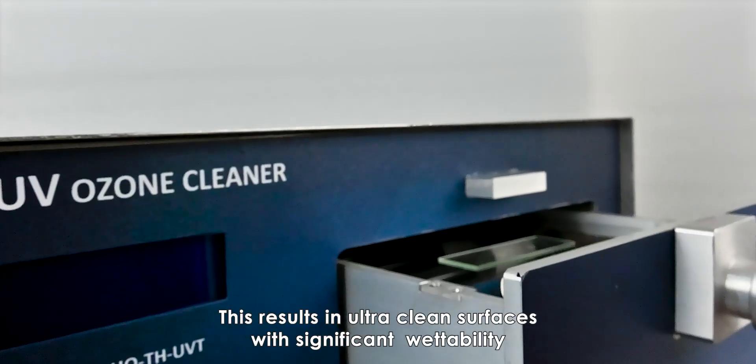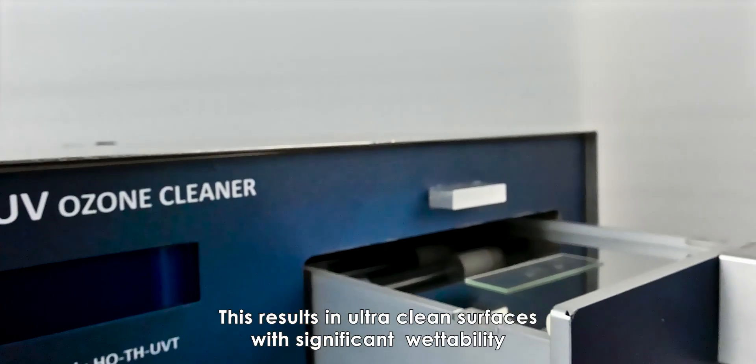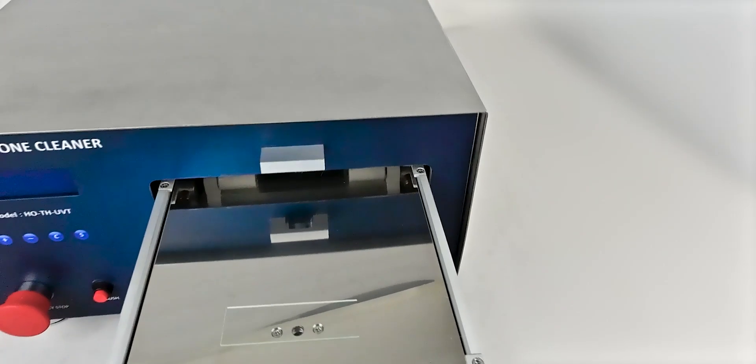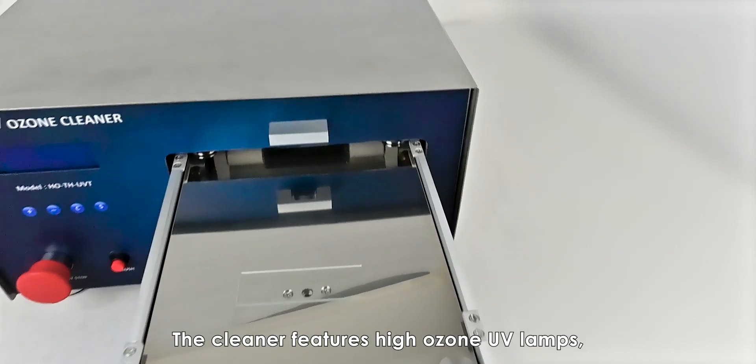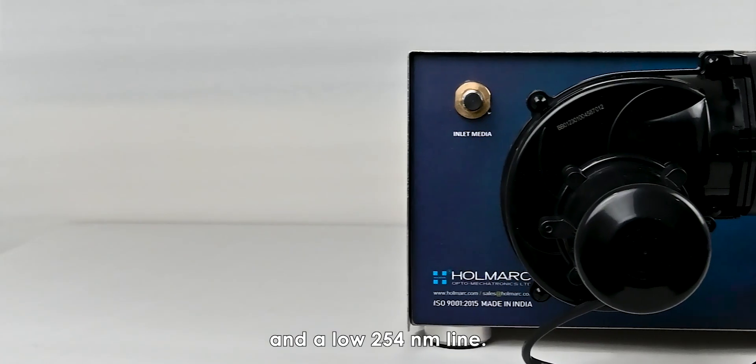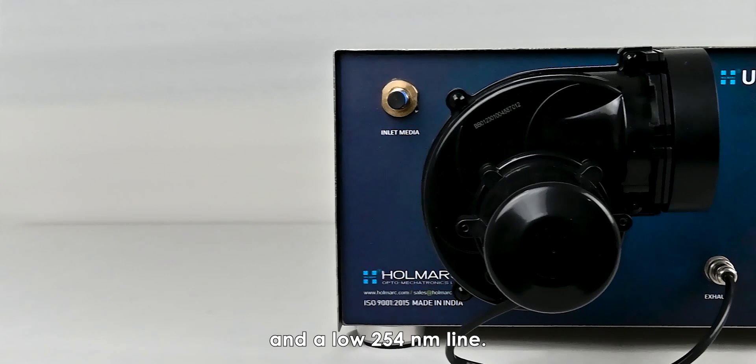This results in ultra-clean surfaces with significant wettability, essential for thin-film coating of glass and ceramic surfaces. The cleaner features high ozone UV lamps generating energy at 185 nanometers and a 254 nanometer line.